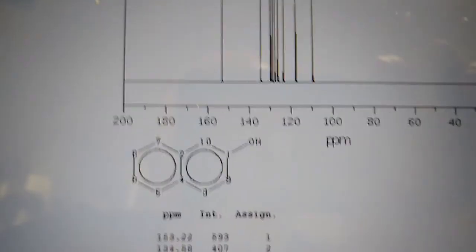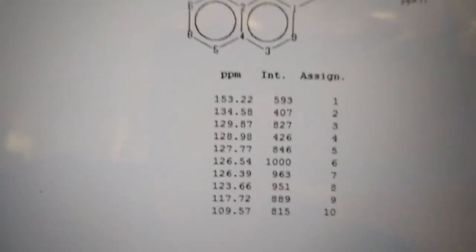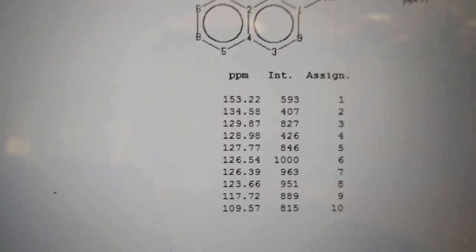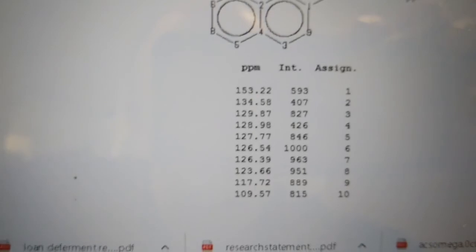So for ten carbons here, unless you have equivalent carbons, you should just see ten signals here. And I'm not going to attempt to count those since the chemical shift is given here. So since we have these chemical shifts and we do have ten signals for the ten carbons, the way you would write it is just like so.